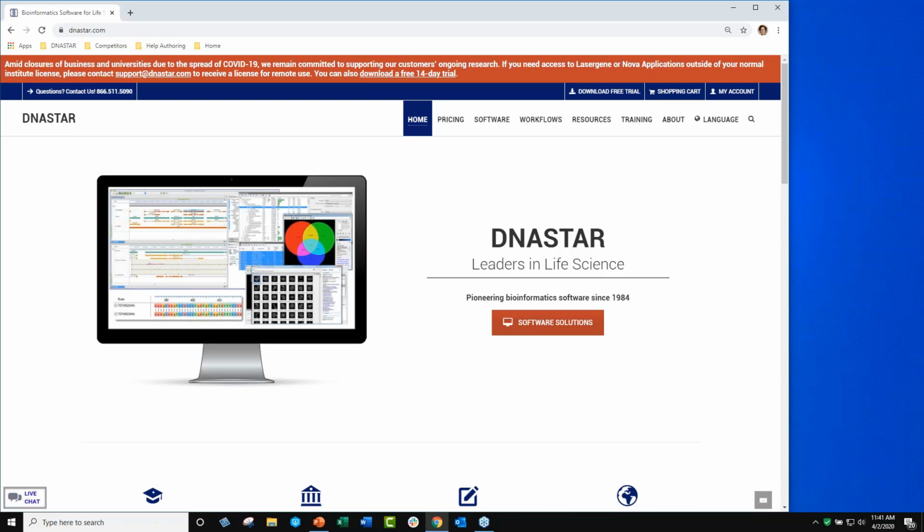But your first line to answer a question, the thing that's probably the absolute fastest, is to go check out our help. So I'm going to show you how to access the training materials while you're working off-site, same as if you're working on-site too. So our polling questions show that not everybody has access to Lasergene quite yet. Hopefully you will all have access by later today, now that you know how to do the free trial download that Brian showed us.